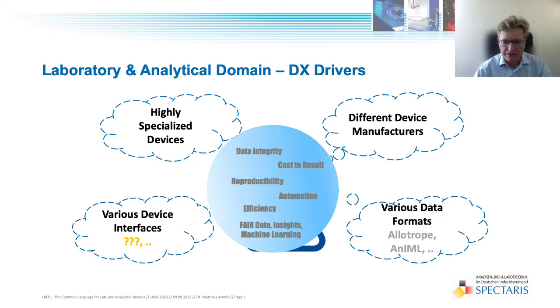Standards are the foundation for driving digital transformation in the laboratory and analytical domain, improving data integrity, costs, time to results, reproducibility of experiments and processes, increased automation and thus increased efficiency, and last but not least, FAIR data, machine-based learnings and machine-based insights, to name just a few.